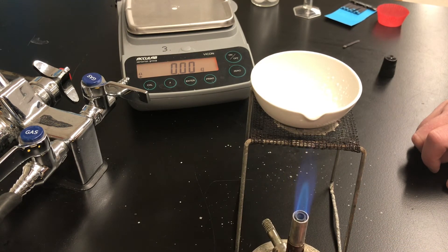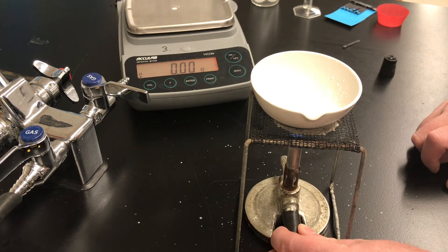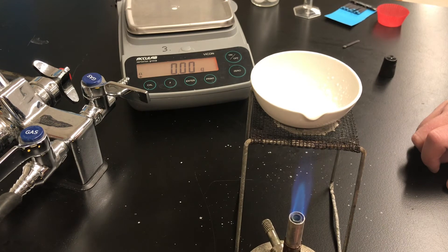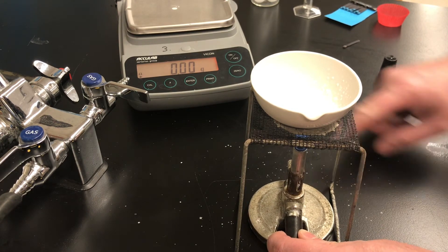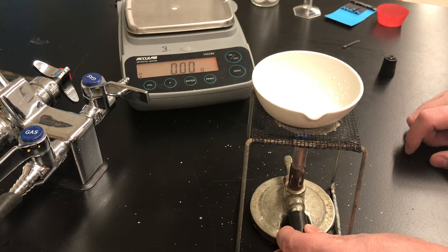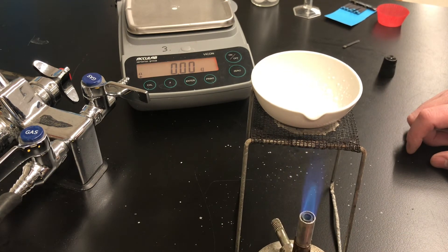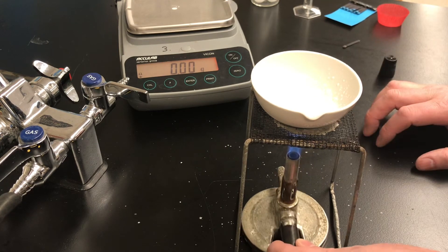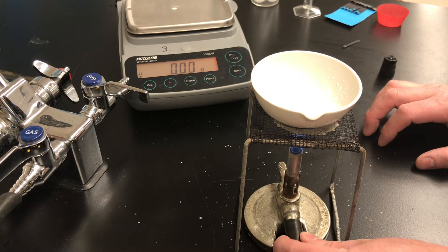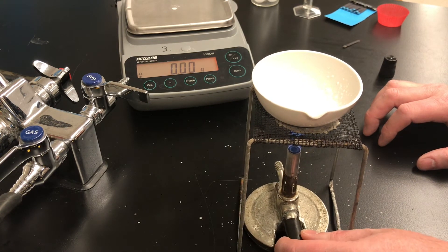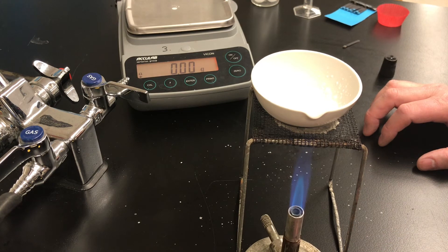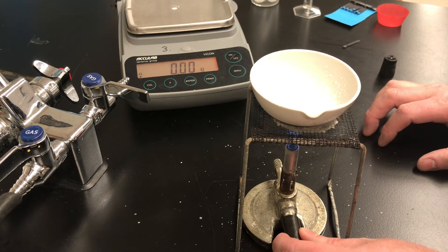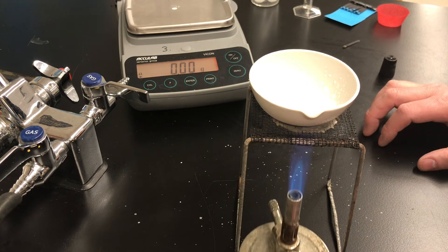I'm pulling the burner out, putting it back under and the salt inside the dish is getting pretty dry. There's some salt that spit out so that's going to be a source of error you want to make a note of. Some people because they are afraid of losing salt to that spitting will stop heating too early. If you stop heating too early then what's left in the dish is not just salt. If you don't heat long enough then you'll still have water left in the evaporating dish and that would be another source of error.